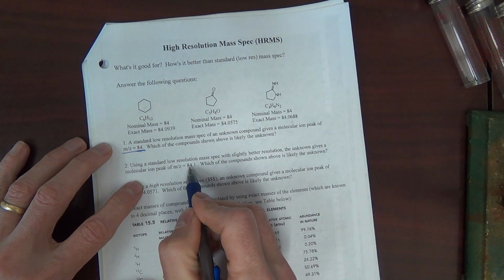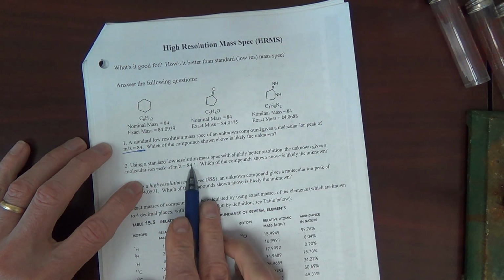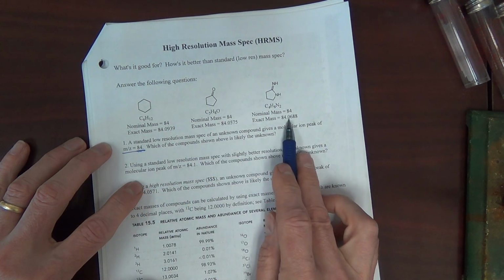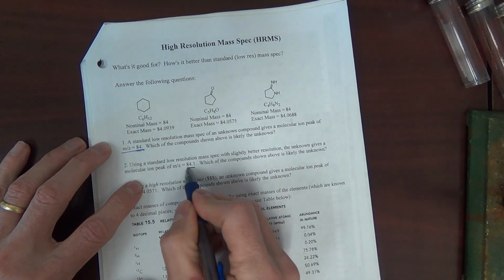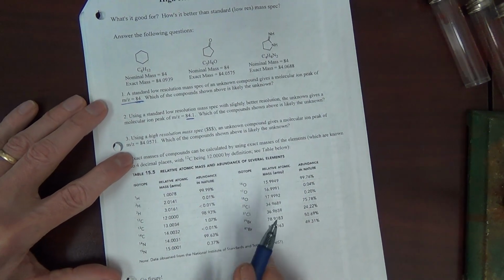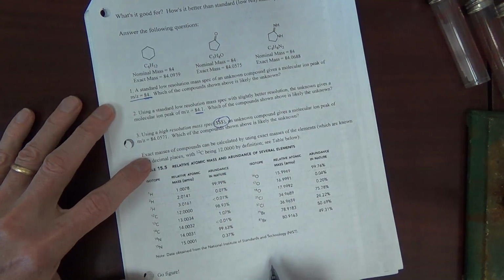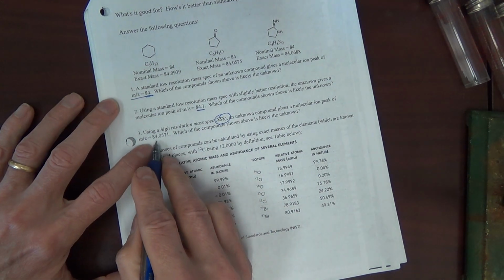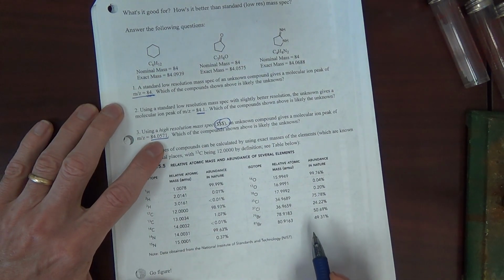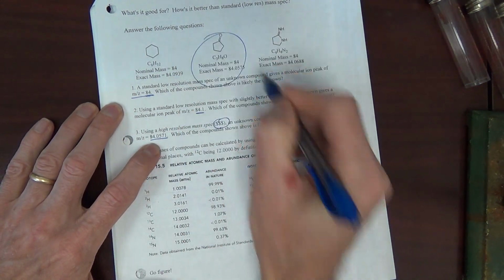What if we get a little bit better resolution and we can get 84.1? Well, it still doesn't give you an answer, because if you round this off, that's 84.1, that's 84.1, that's 84.1. They're all three still 84.1. On the other hand, if we get a very sophisticated instrument with very high precision, known as a high resolution mass spec, which is going to cost us some money, we may get a molecular ion of 84.0571. If we do, that gives us some pretty good evidence that the answer is here. We have that molecule.